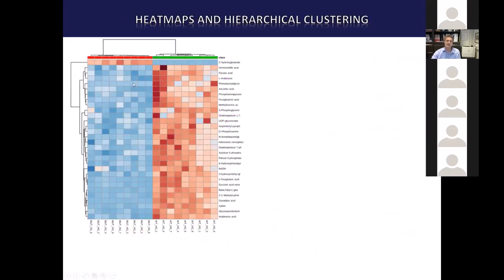Other ways to look at this data, this is hierarchical clustering. This is now multivariate statistical analysis. And this gives us basically a way of ranking those metabolites or clustering them together, showing how they change in a similar or different way. And there's a heat map output to this, so that mutant is red, wild type is green. You can see lots of things go down other than 2-hydroxyglutarate, and lots of things are higher in the wild type other than 2-hydroxyglutarate, which is lower.